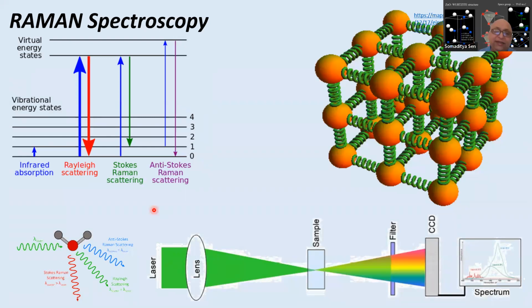We have found in many cases that FTIR and Raman can both be done on the same sample. But basically, it gives different phonon modes. If you look into group theory, some modes are Raman active and some modes are not. Those which are not active can be obtained from FTIR. So this is the only difference, but we probe the different vibrational modes using these two.